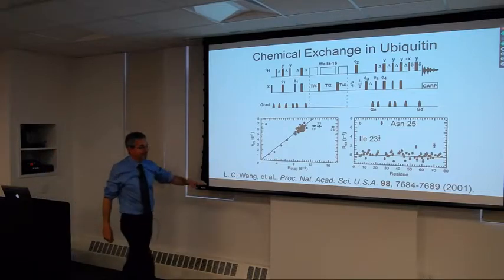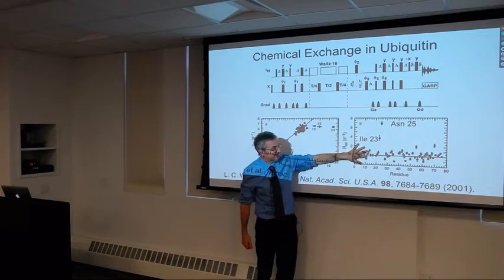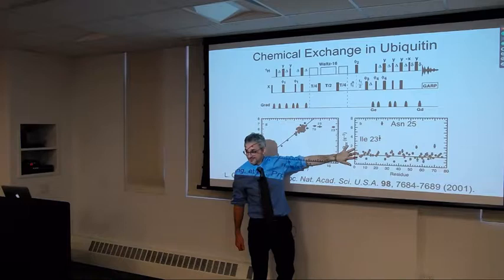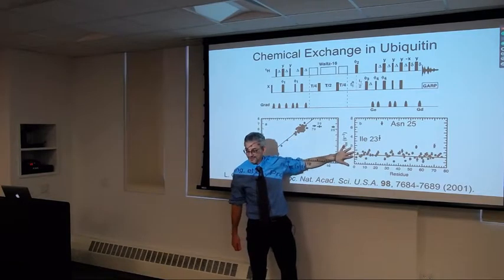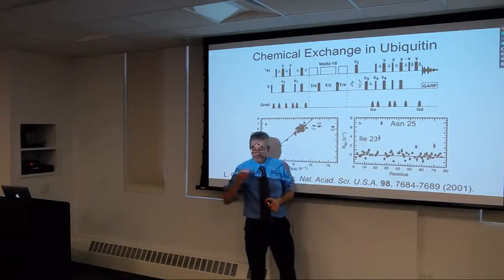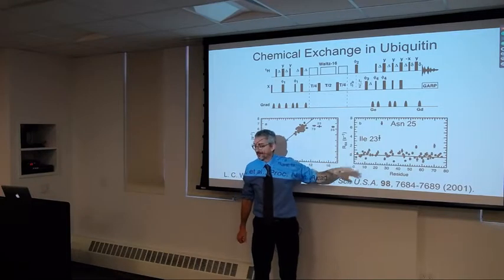So the smallest chemical exchange that one can detect by this experiment depends on the variation in the chemical shift anisotropy. So you can see that's more or less plus or minus 1 reciprocal seconds, which means you really need a chemical exchange broadening of probably at least 2 per second before you can reasonably detect it with this experiment.